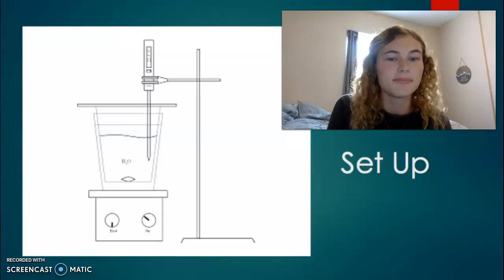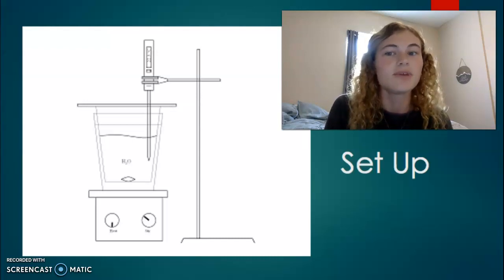So how's it set up? This image shows a basic setup of a calorimeter. In lab, we create a calorimeter by using two styrofoam coffee cups and a lid. The double layer of the cups improves insulation to reduce heat loss to the outside of the calorimeter. If we lose heat, then the recorded temperature of the surroundings would be skewed and our data would be less accurate. The lid also minimizes heat loss by creating a closed system.